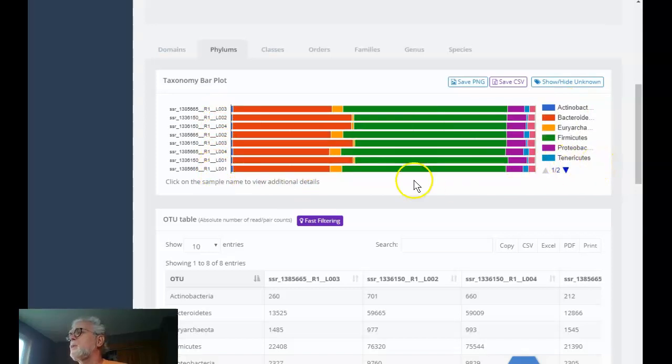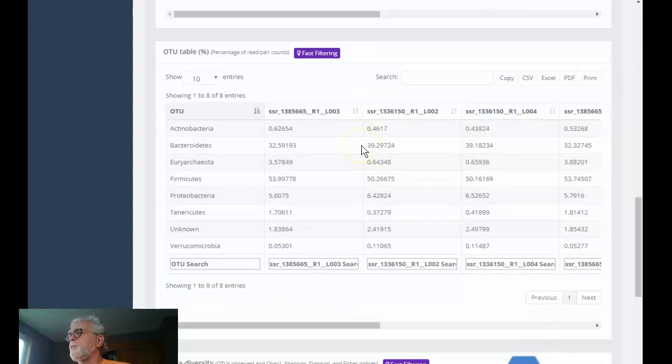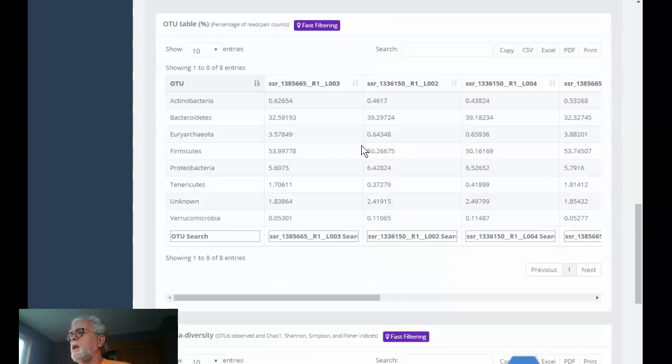Now you notice they jump around, and the numbers vary a bit. Sometimes you have the percentage jumping back and forth between the two. And that is because the passes will sometimes pick up slightly different things. And we can go down and we can take a look at everything from all examples and proceed there. We have the detail information here. We have more detail here and here.